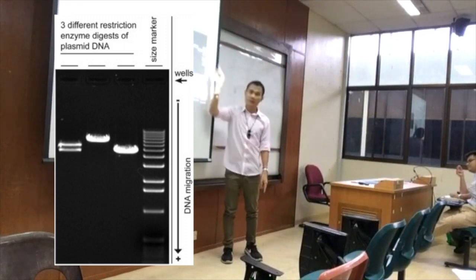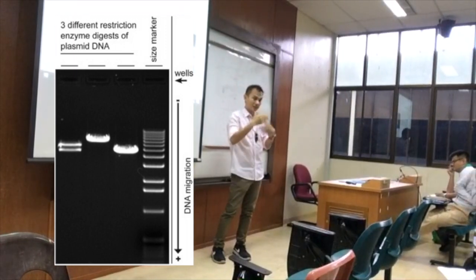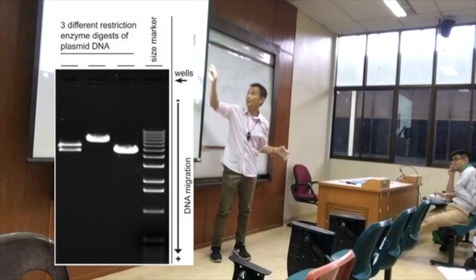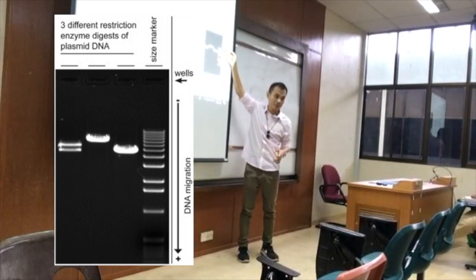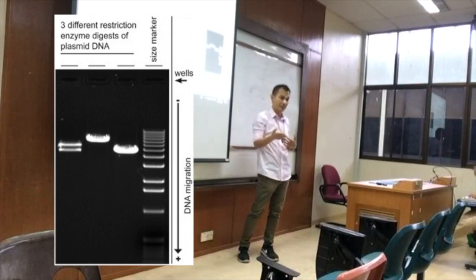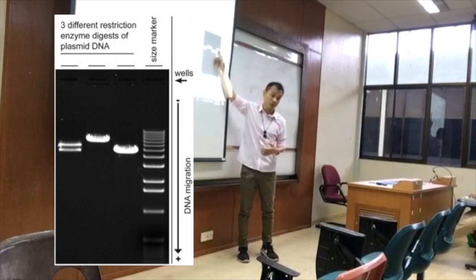So basically, you use restriction enzyme, like Aisha said, you cut the DNA, and in that ladder, you already know that, for instance, this is 100, 200, 300, 400, 500. I don't know which ladder that they're using here, but with that ladder, you already know. There's so many different standard ladders. So for instance, this might be 500, and your size is 500, and you know that you're actually amplifying the right gene.